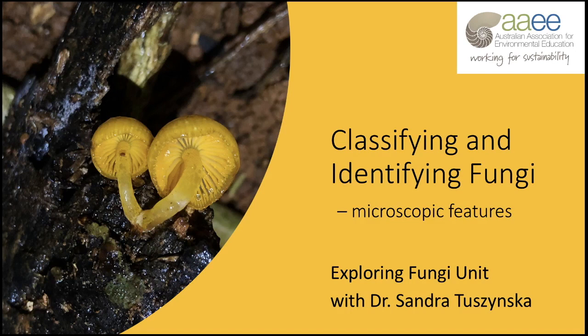So this is where you need to use a microscope to actually identify fungi. Remember last time we learned about the different features of mushrooms, the stipe and the cap and how the gills are arranged, and all of this cool stuff with many different words. And before that we looked at the general shapes and how we can group fungi into those. Now we're going to look at the mini stuff, the microscopic features, using a microscope and seeing what is happening under there that we can't see with the naked eye. This allows us to really make a good identification of a fungus, put a name to it.